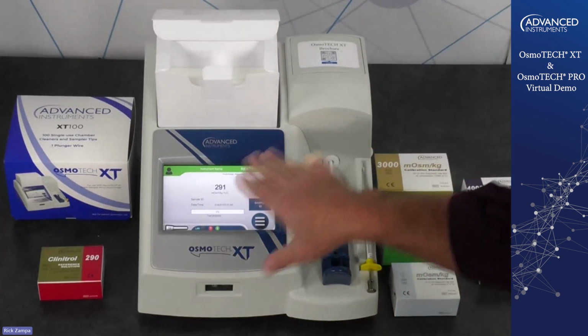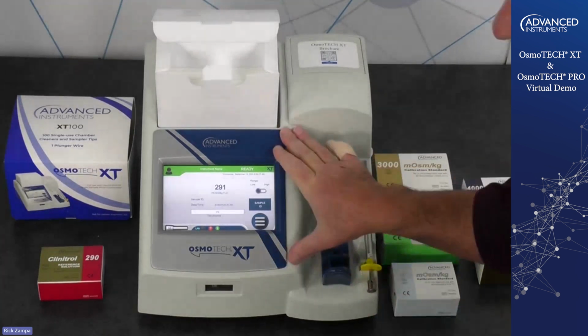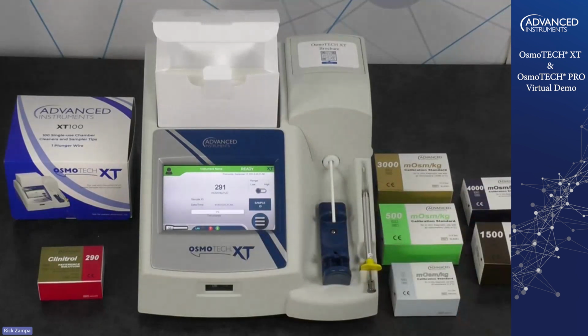Now, I have this instrument set up in its most basic format. As Shweta was talking about, all these instruments are capable of complying with EU standards, FDA standards, pharmacopoeia standards, and those types of things. But the way I have this set up right now is in its most basic format.